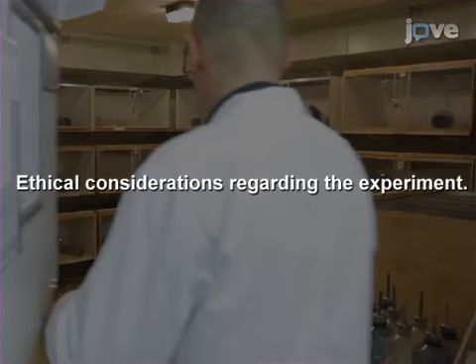Please notice that the resident-intruder paradigm is not free from ethical concerns. Serious suffering may occur in the intruder male. Potential animal suffering should always be in balance with the main scientific aims of the experiment.